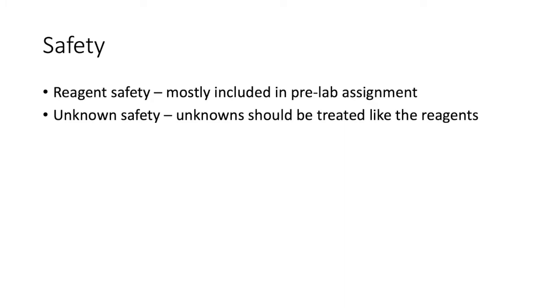In this experiment, we'll be using a number of different reagents, and you'll be looking up the safety information for several of them as part of your PreLab assignment. Some of the reagents that we'll be using are not covered under WHMIS regulations, things like sodium chloride or potassium chloride. And many of these materials that aren't WHMIS regulated are going to have similar types of hazards, where they can cause skin or eye irritation and are not particularly toxic.